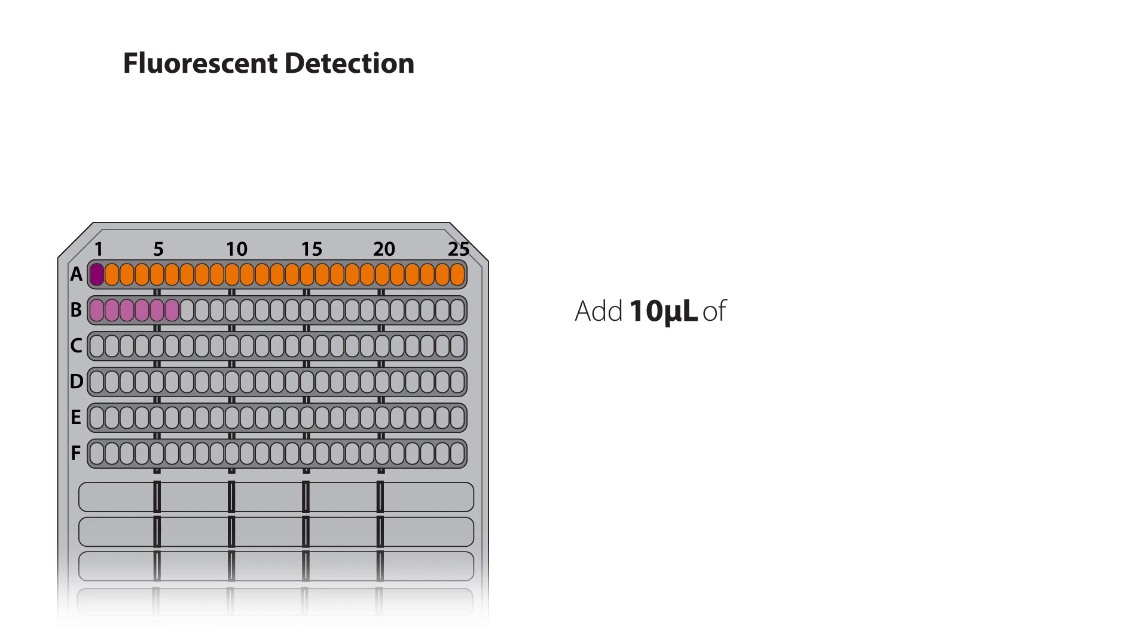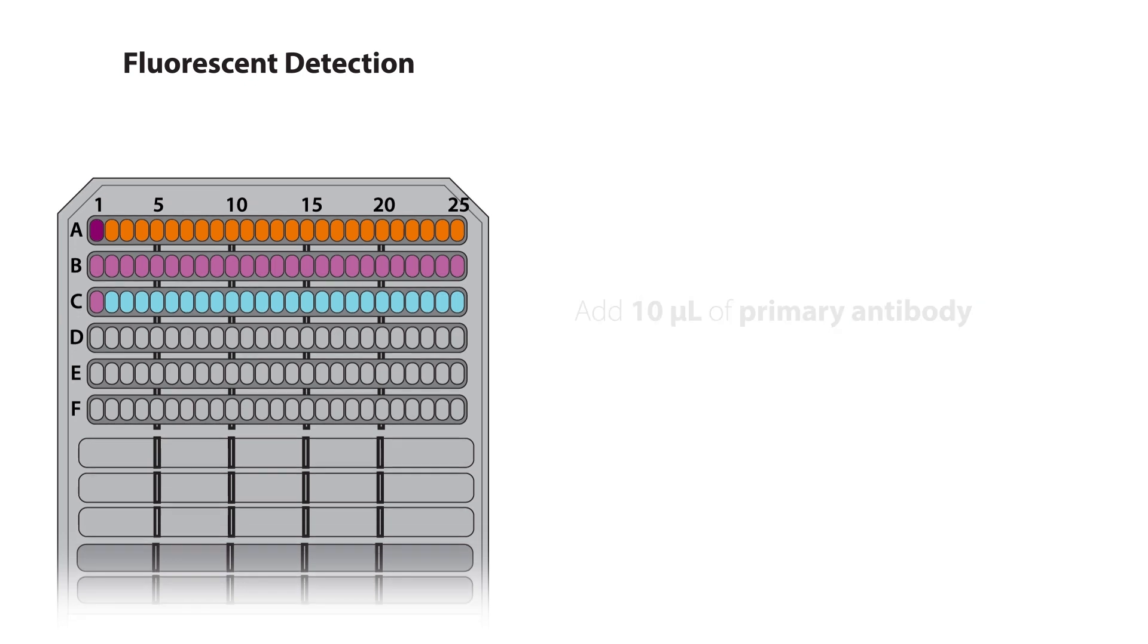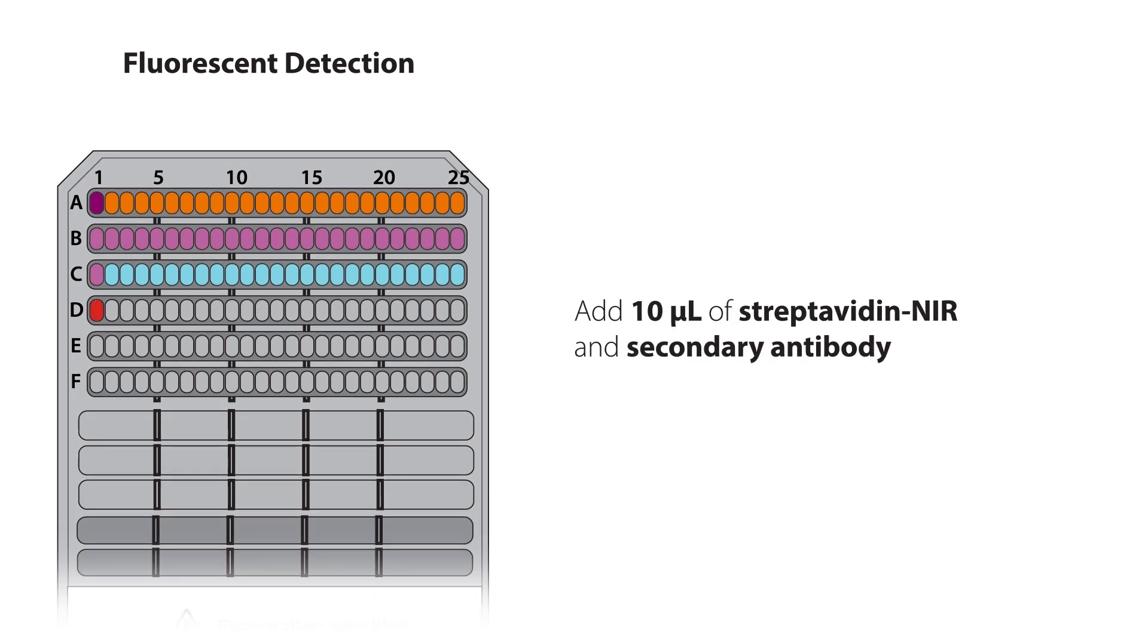Add 10 microliters of milk-free antibody diluent for blocking, 10 microliters of primary antibody, and 10 microliters of streptavidin NIR and secondary antibody.